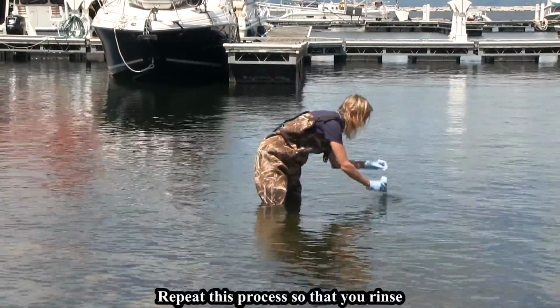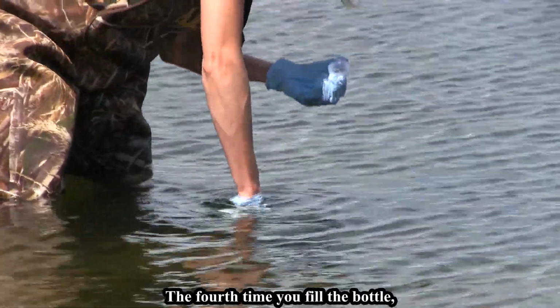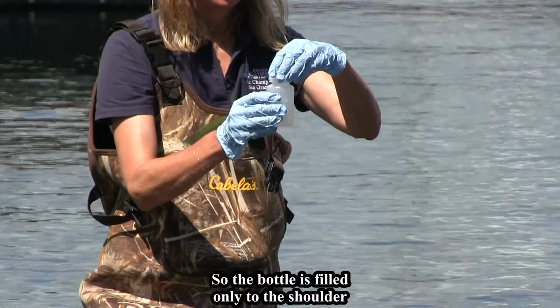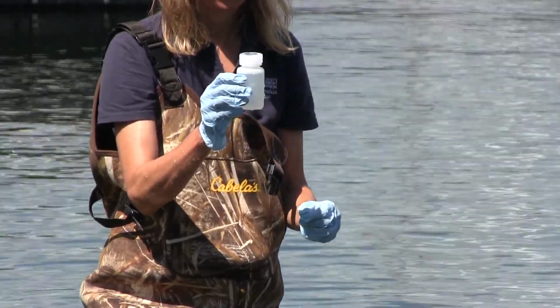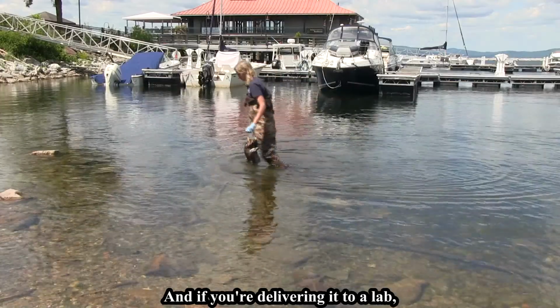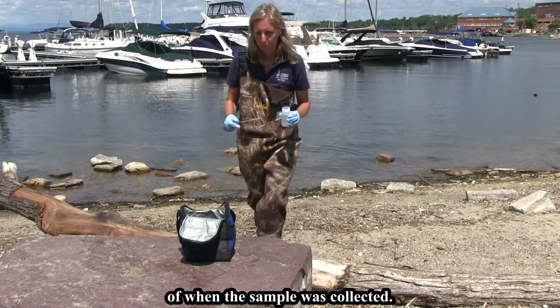Repeat this process so that you rinse the sample bottle and cap 3 times. The 4th time you fill the bottle, again, pour off a little of the sample so the bottle is filled only to the shoulder, and then firmly cap the sample. This is your collected sample. Immediately place your sample in a cooler on ice, and if you're delivering it to a lab, be sure that you get it there within 6 hours of when the sample was collected.